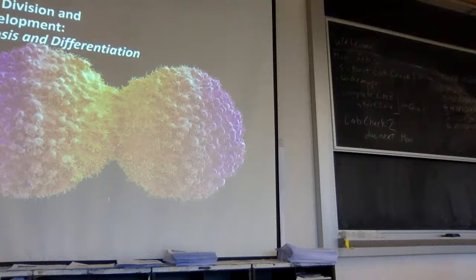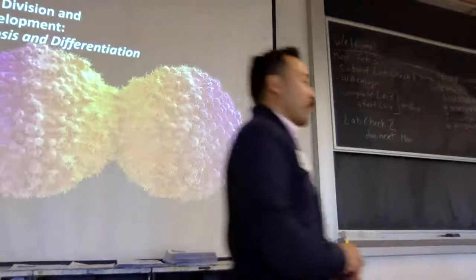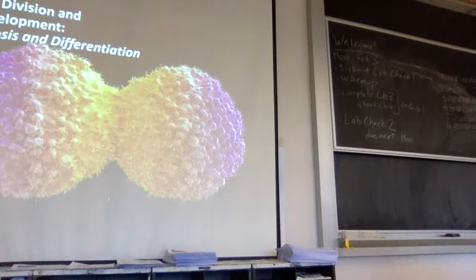Okay, so in lab today, we are going to be looking at cells undergoing cell division, a form of cell division called mitosis. So we'll learn what mitosis is, what the purpose of it is, and what happens to cells during this process.